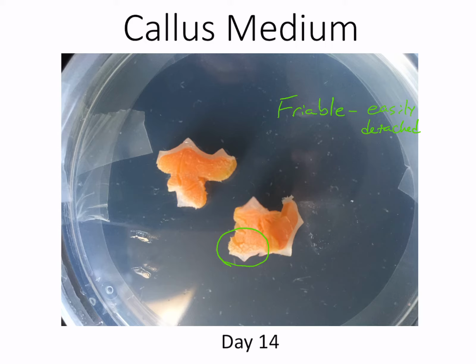Callus is undifferentiated tissue. Undifferentiated plant cells. So they are not committed to any sort of developmental pathway, and they're pluripotent and totipotent, and can develop into whatever sort of organ is needed.